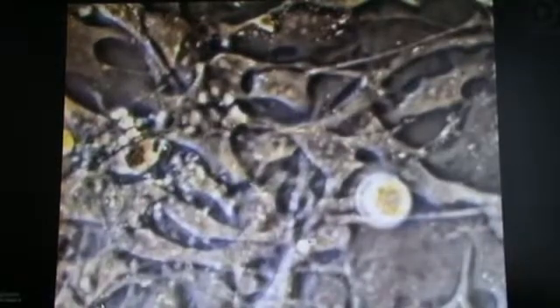Another section of the same sample shows the tumor cell, as shown here on the top right, which divides itself in 30 minutes. This process can be precisely followed through the use of time-lapse photography. The same situation as found on a different part of the same tissue structure. In comparison, if you use a conventional bright field microscope, such fine details cannot be seen.